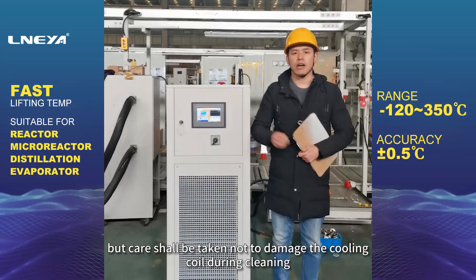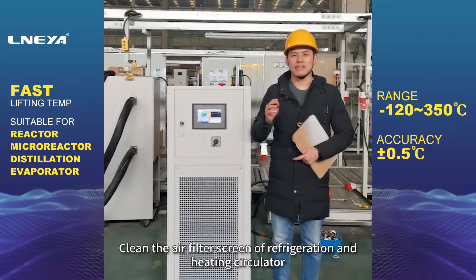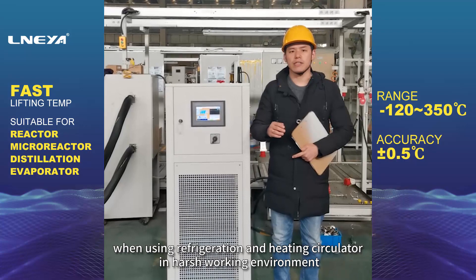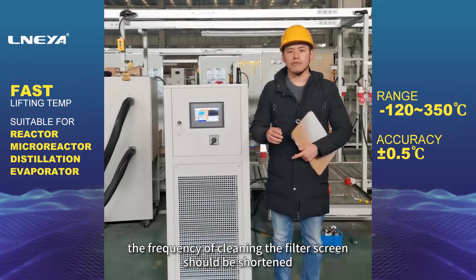For cooling effect, the cooling coil of the refrigeration and heating circulator shall be cleaned regularly, but care shall be taken not to damage the cooling coil during cleaning. When cleaning the air filter of the refrigeration and heating circulator in harsh working environments, the frequency of cleaning the filter screen should be shortened.